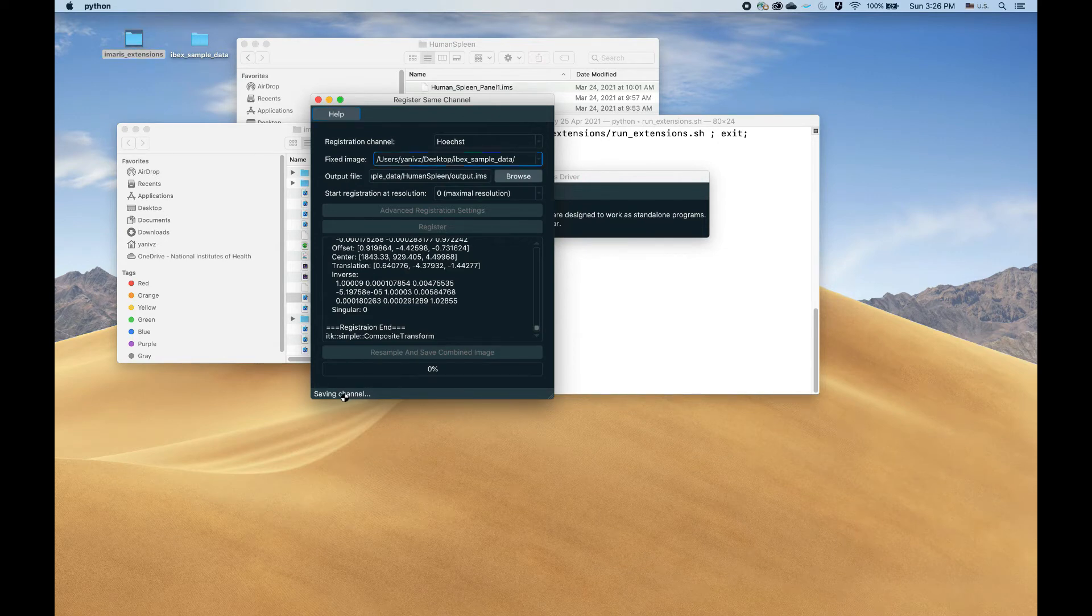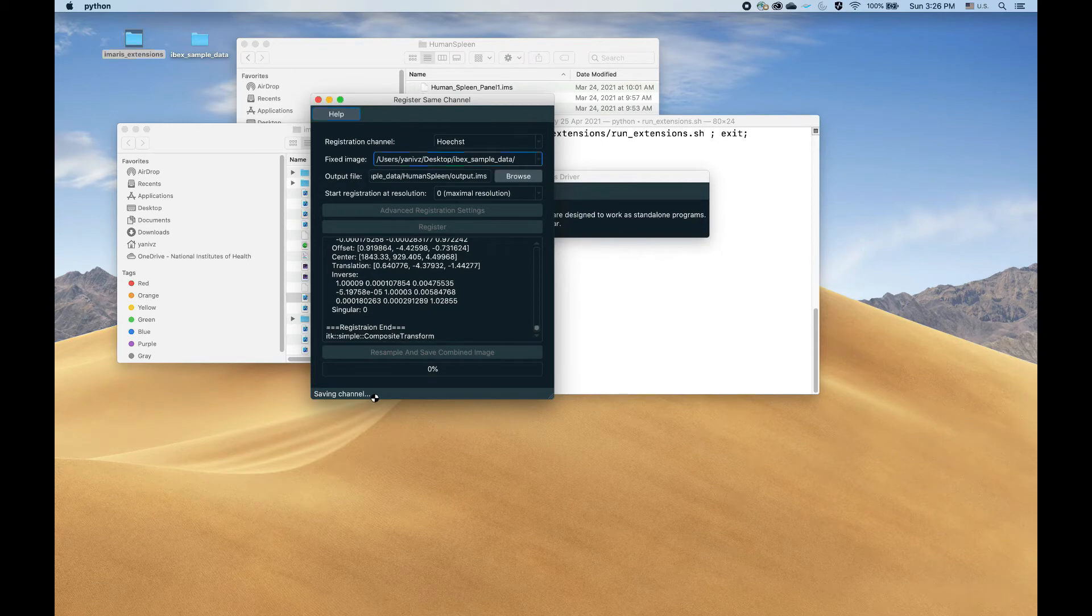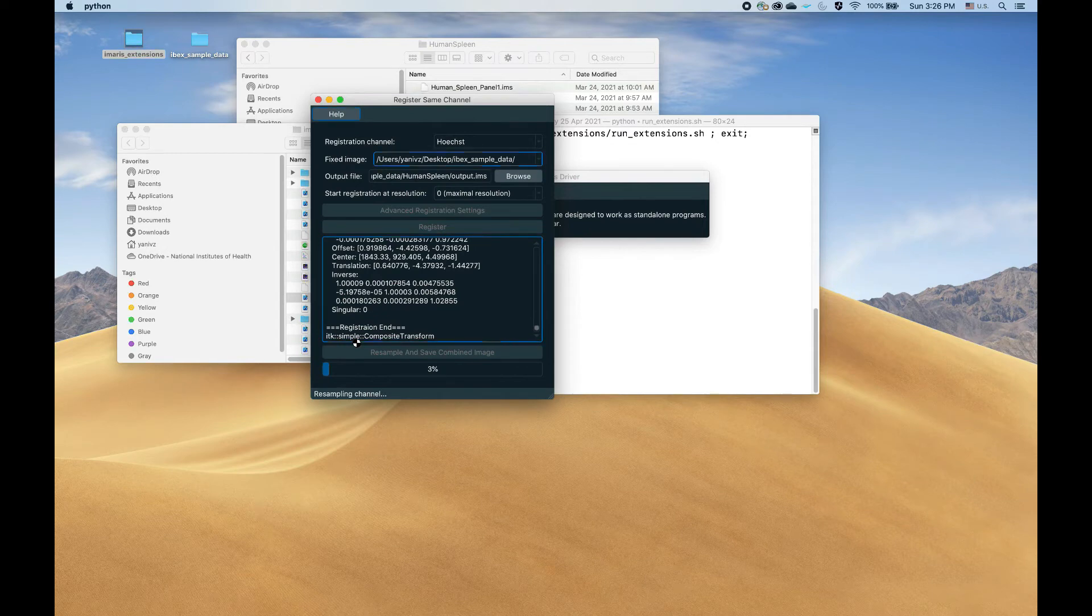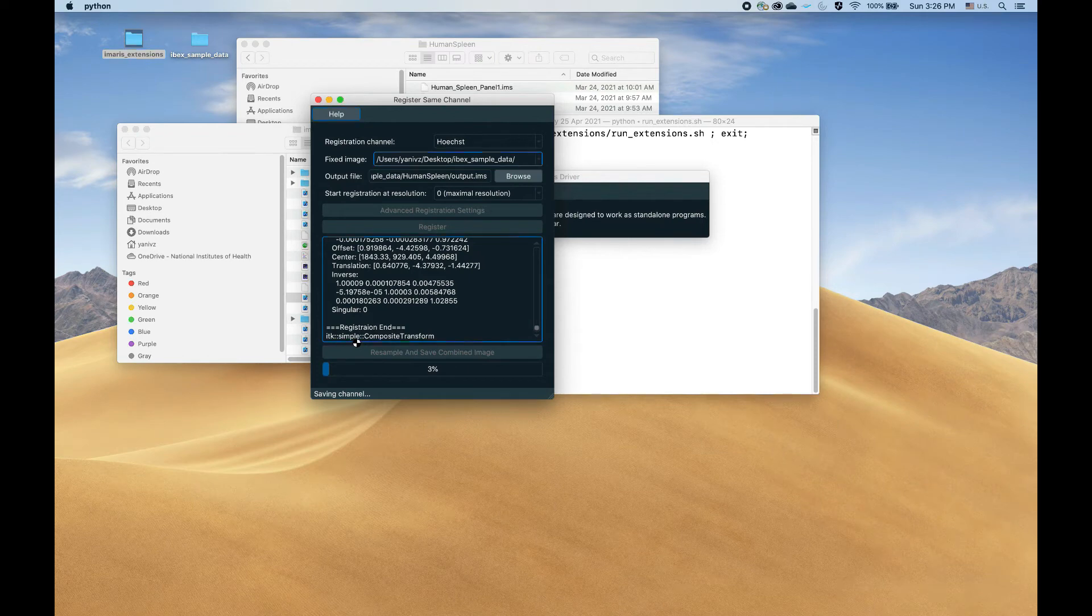Most of the time it takes to write the channel back to disk. So that's the saving channel, and you can see that the actual reading resampling are pretty much instantaneous. Writing to disk takes a while.